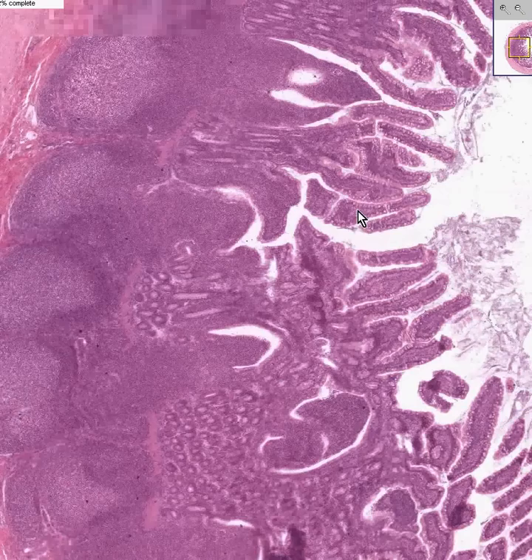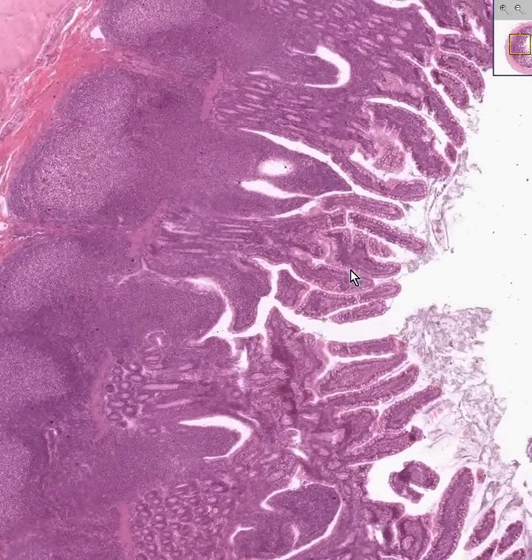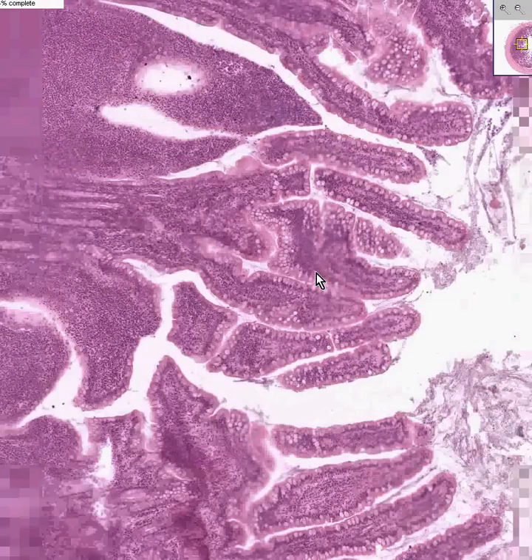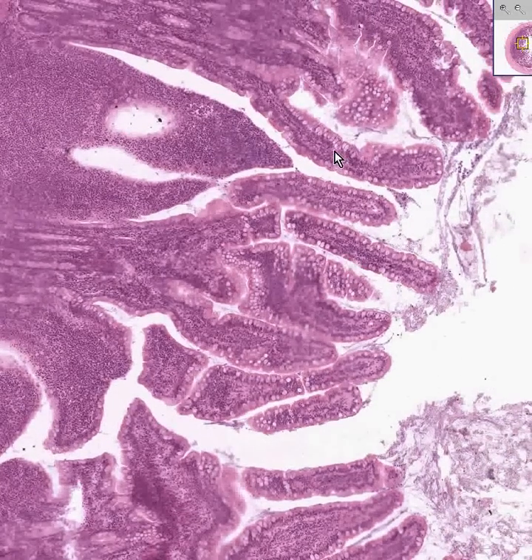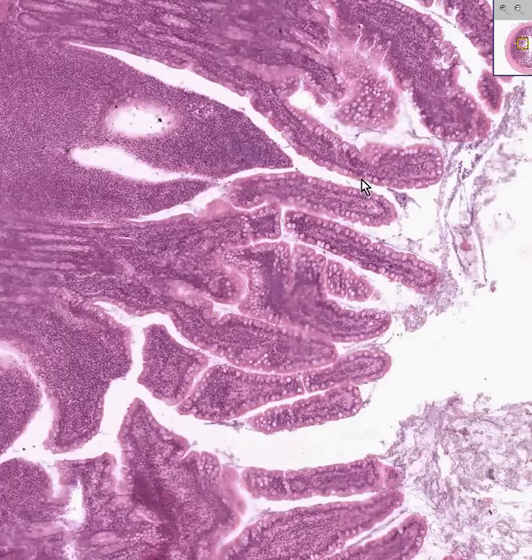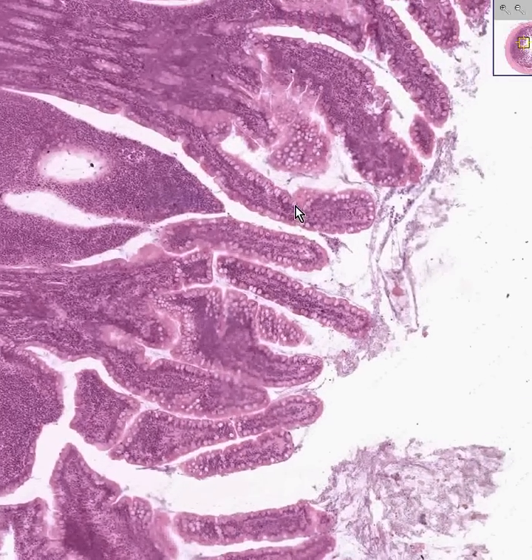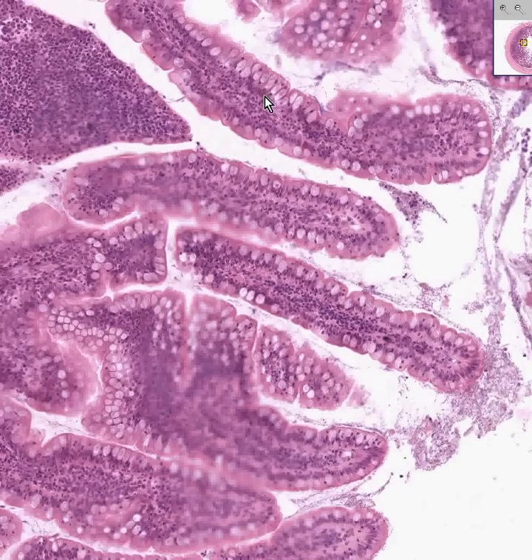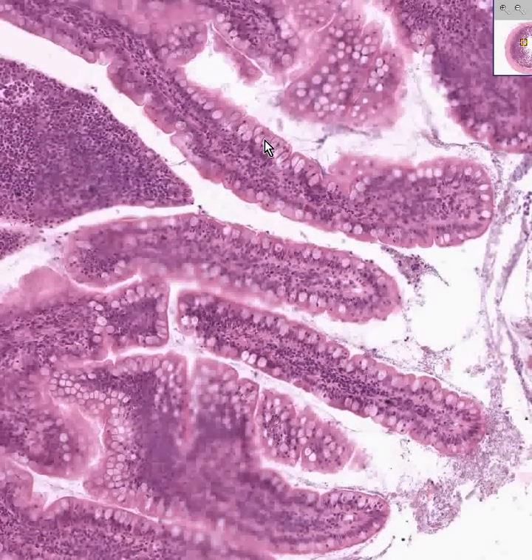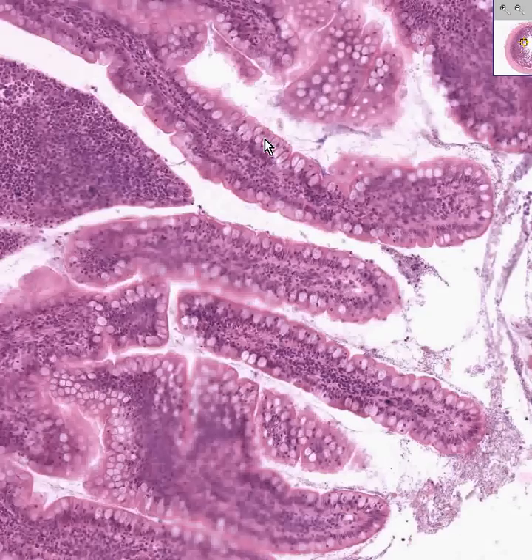Let's go from the lumen to the outside. The mucosa of the small intestine is arranged in a very distinctly papillary fashion. You can see these clear cells, which are goblet cells, and the cells which are not clear are absorptive cells. The chief job of the small intestine is absorption, so there is an abundance of absorptive cells. As you go further down, you get more goblet cells — generally more in the ileum relative to the jejunum.